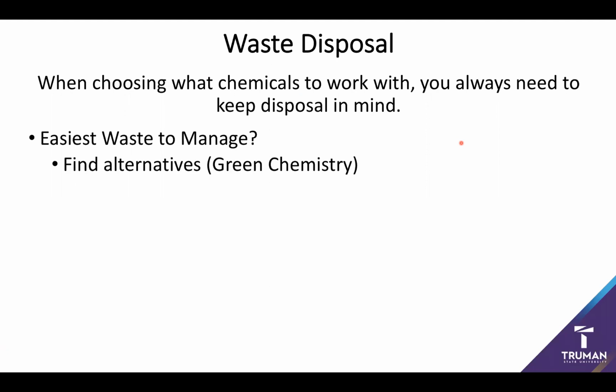This is the whole field of green chemistry. If you have to choose between a procedure that generates a lot of waste versus something that generates a little, say something that goes in 2 steps instead of 10 steps, a procedure that needs a lot less solvent or produces things that are drain wastable, always go for the ones that produce the least amount of waste. This is the whole idea behind the field of green chemistry.